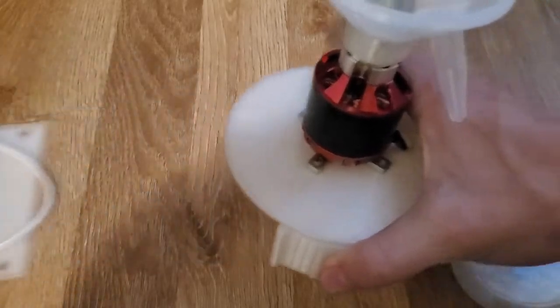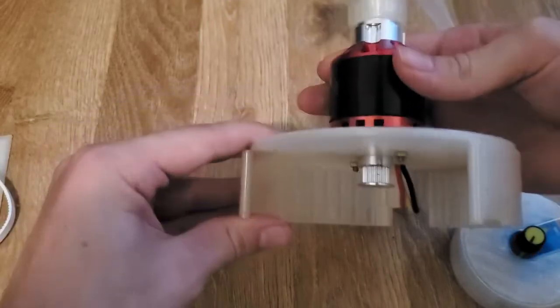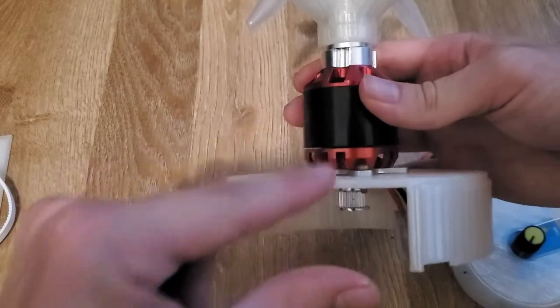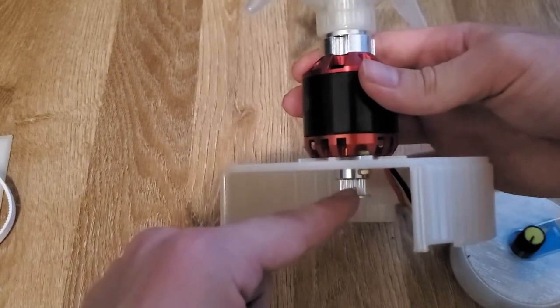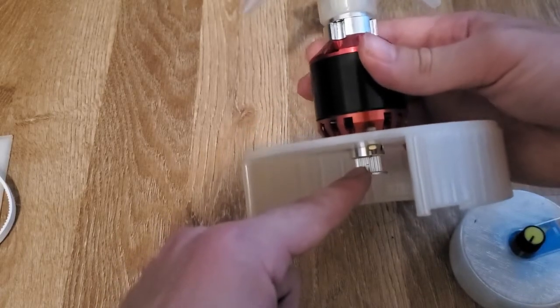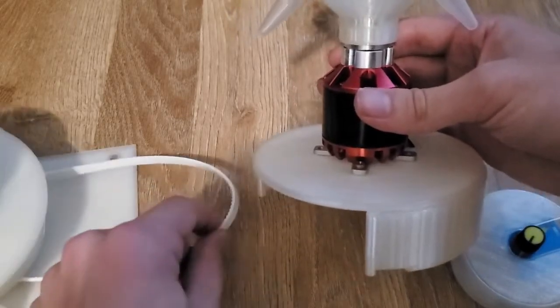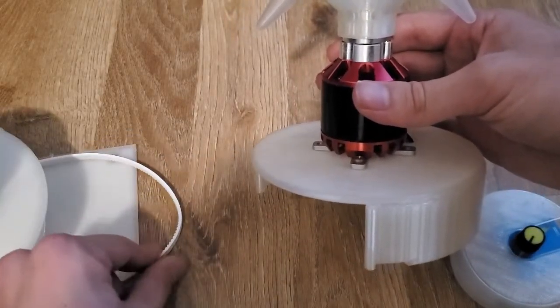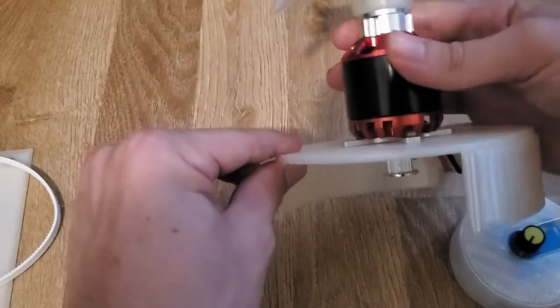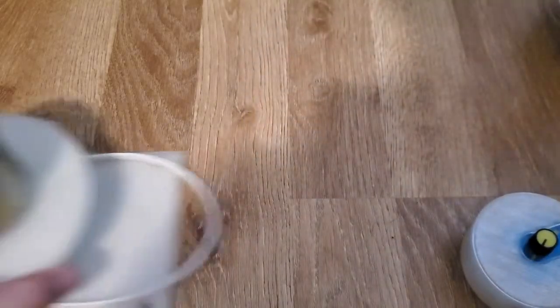On the right side, we have the motor, which is mounted. It actually has a shaft that runs through the whole motor, so you can have a second attachment point here. This is just a standard GT2 belt pulley. It attaches to this 3D printed belt that I have here. It's a custom dimension. And that transfers basically the spinning forces from this to our second component, which we have here.